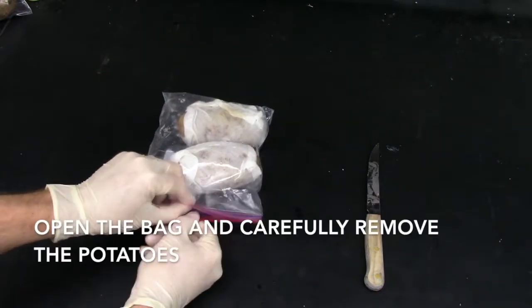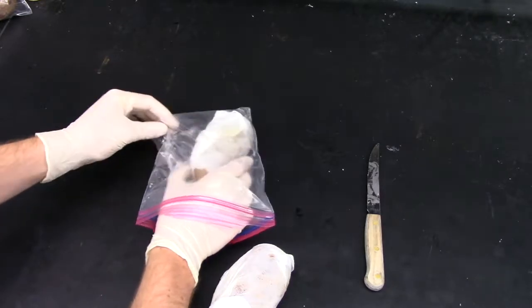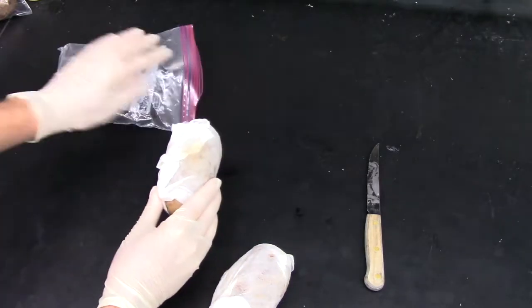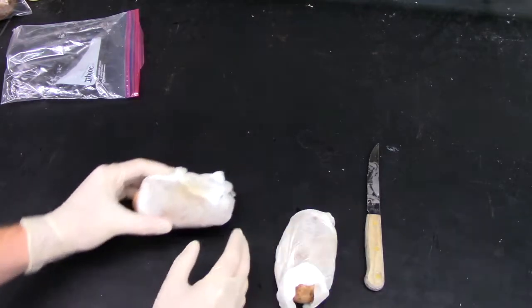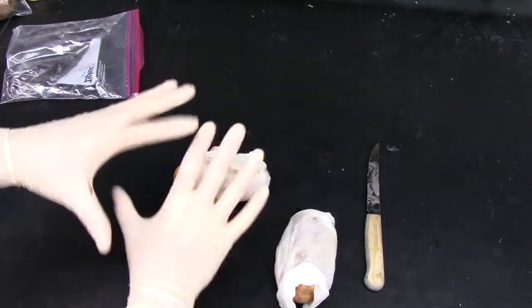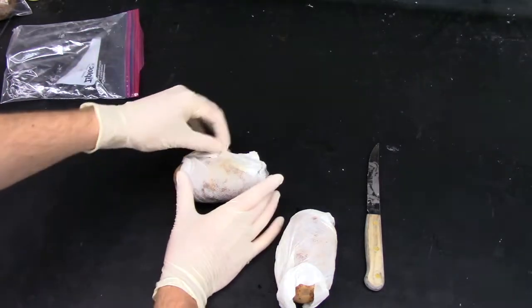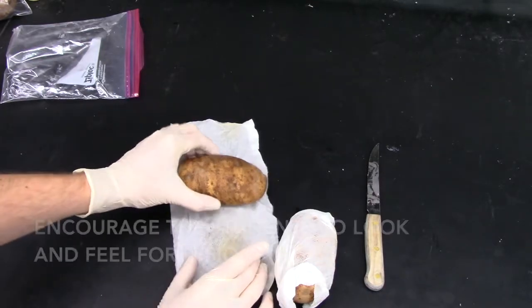So I will open and carefully take these out. It's important to note that if an area is actively being infected, it is going to be very, very soft to the touch. And it's important that we observe the macroscopic or kind of visual symptoms on the outside first. So I will delicately remove this potato.